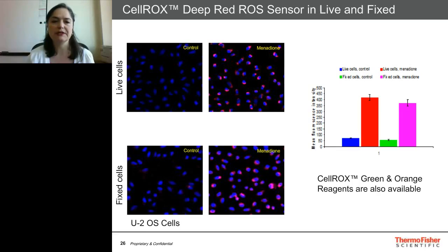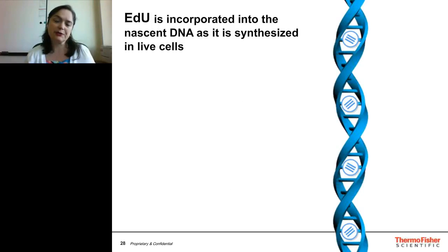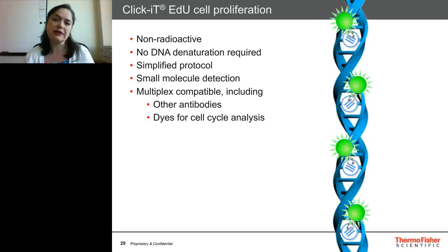So another common question to ask about your cells or tissue is what's proliferating. And EDU is a pretty common way. You use a modified uracil that labels DNA while DNA is being made, and that would be while your cells are proliferating. And then it gets incorporated into the DNA, and you can label those special sugars that got incorporated into the DNA while the cells were proliferating.